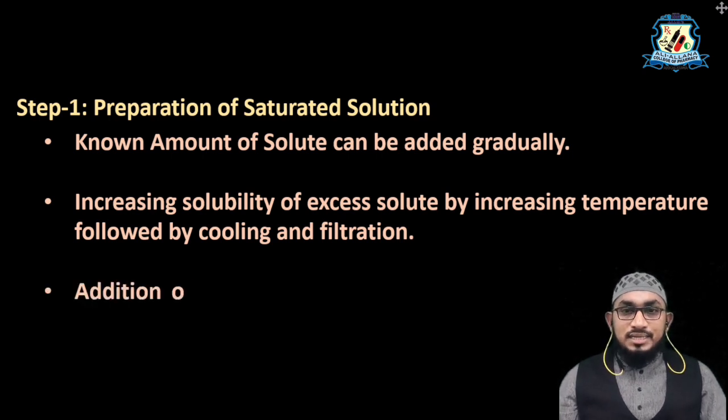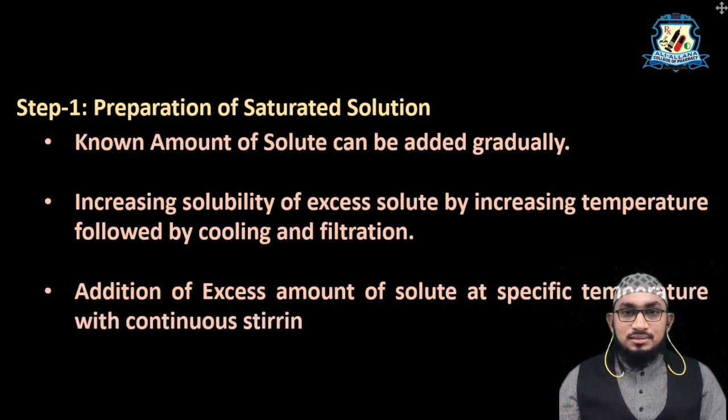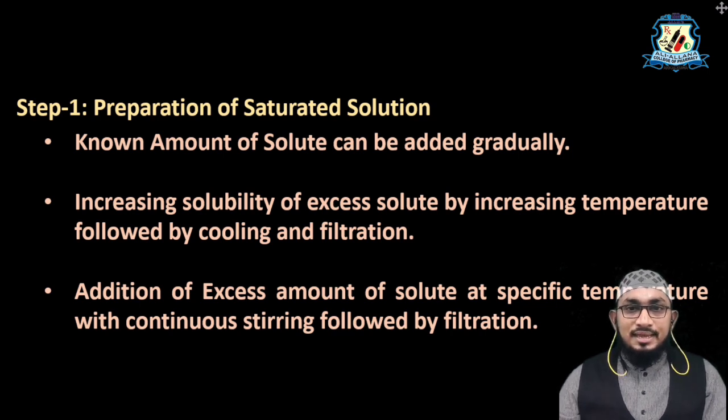The third method for preparation of a saturated solution is addition of excess amount of solute at a specific temperature with continuous stirring, followed by filtration. In this method, we add excess amount of solute at a specific temperature with continuous stirring, and keep it aside for a longer period, say 24 hours. After 24 hours we go through filtration, and whatever filtrate we get will definitely be a saturated solution.